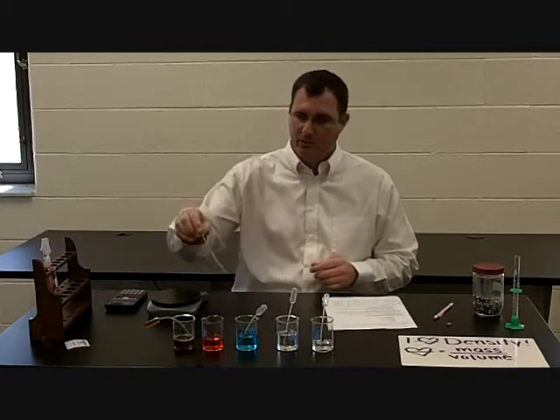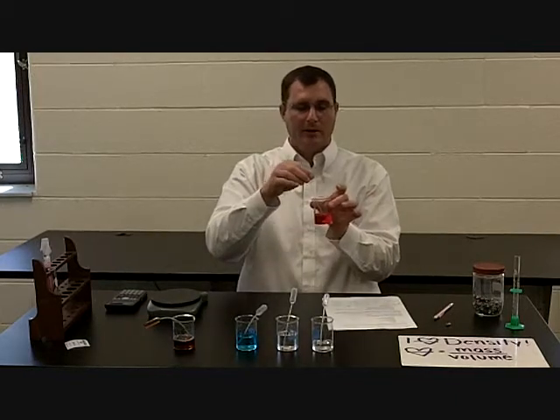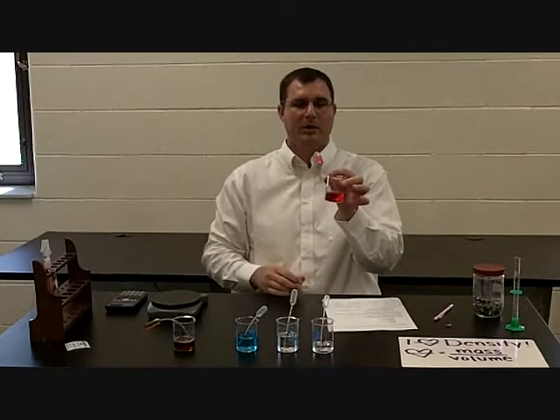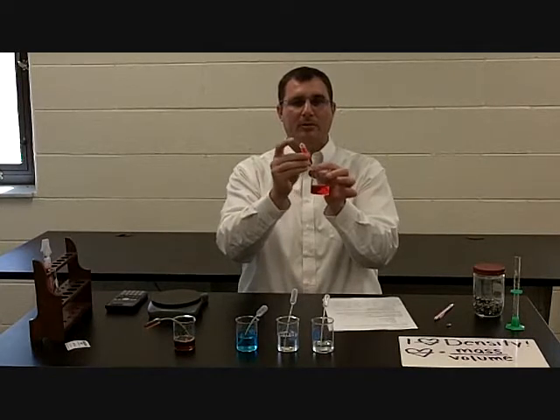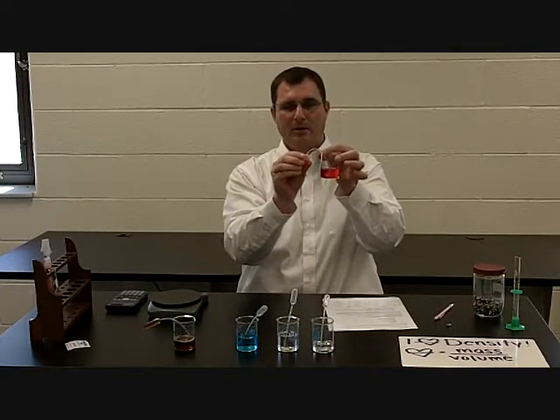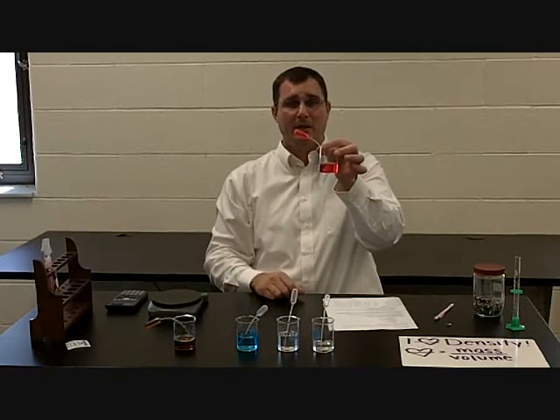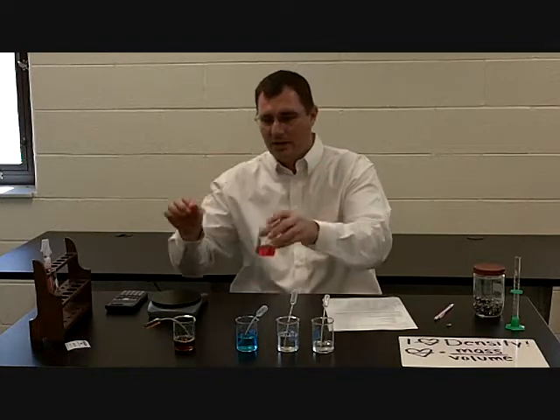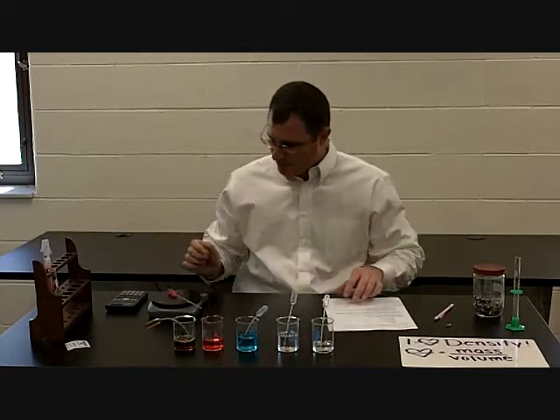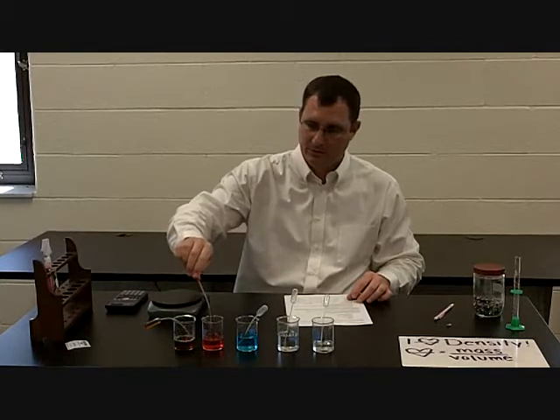Once you do that, then we're going to fill a pipette completely. Now, a little trick to filling a pipette: you take one squeeze, and it only gets maybe 2/3 to 3/4 of the way up. Once you do that, bend it over so the air is up, squeeze out the air, and fill it, and now it'll fill completely. So once I do that, I'm going to reweigh, and I get 5.7 grams.